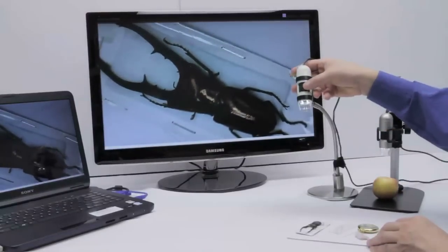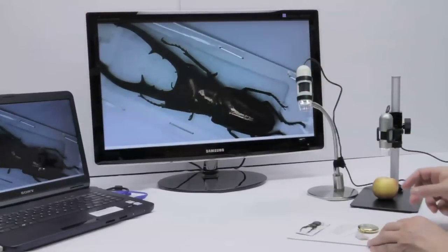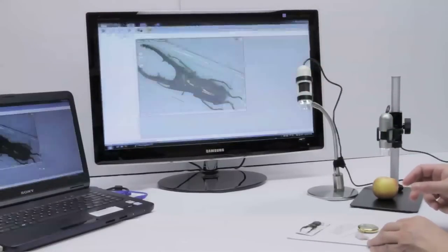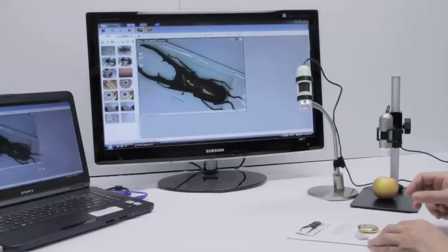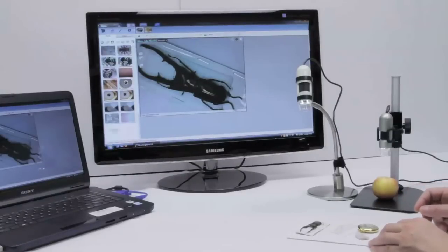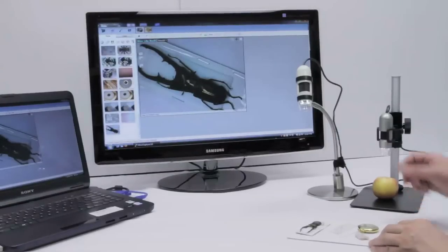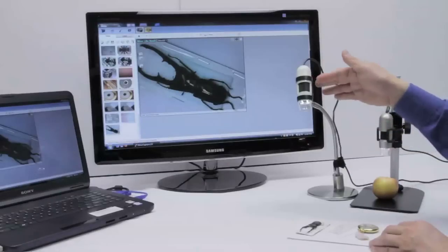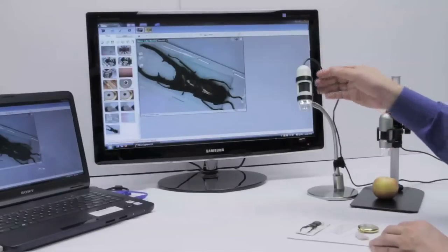There are two different ways to take a photograph. The first way would be to mouse click on the icon in the window. The second one would be to press F11.